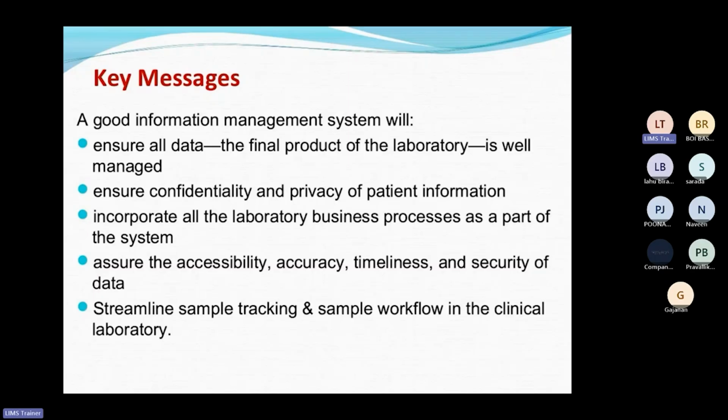Then the different timelines. Then the security of the data. All these things are important. Also one more very important aspect: suppose you all understand the validation of the different instruments and equipment, validation of the different products and their batches, right? Then the calibration of the instrument.